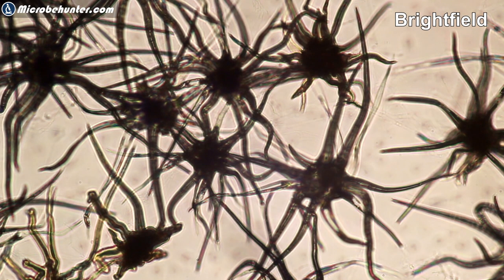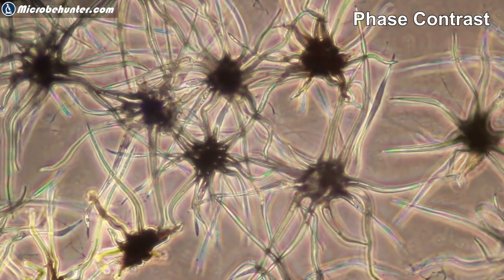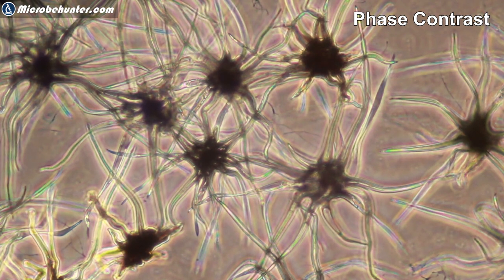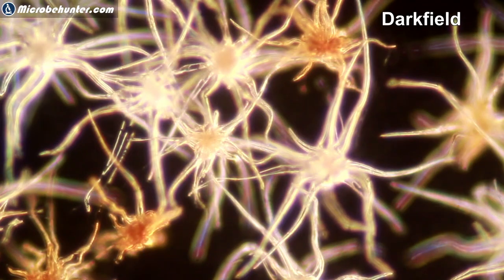Next one. These are so-called trichomes, plant hair. And again, here now in phase contrast. I like doing this switching back and forth. I think you get the point. Again, dark field.